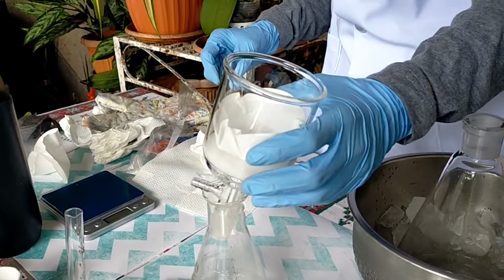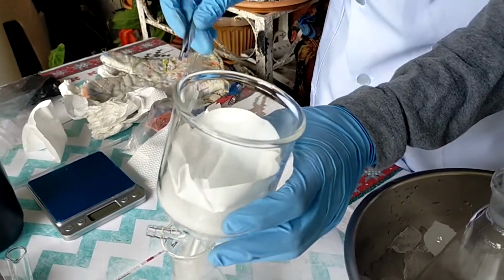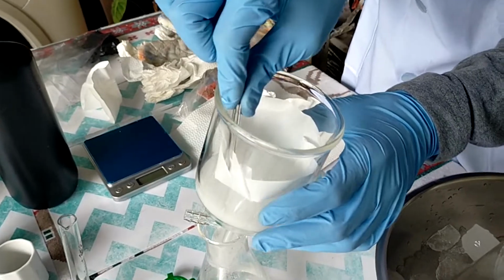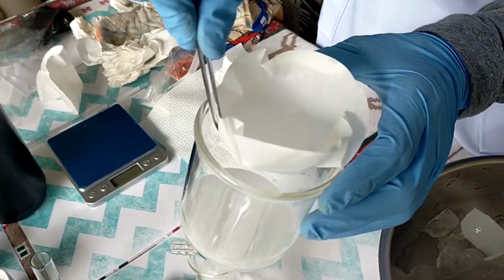Okay, now that most of the filtrate has dropped, we will obtain this. We will be using these tweezers to obtain this.